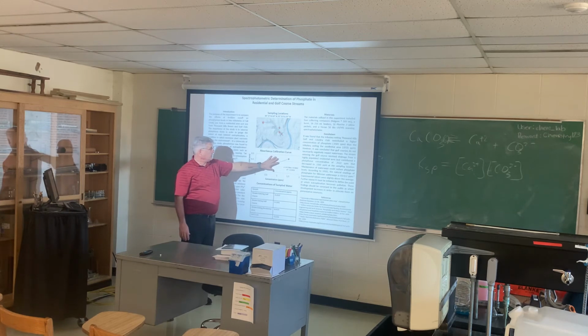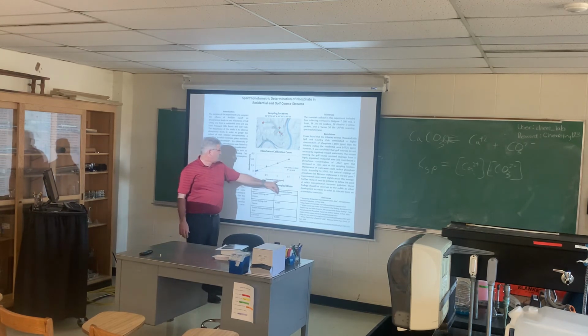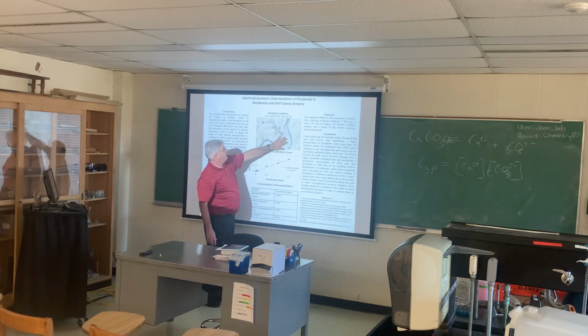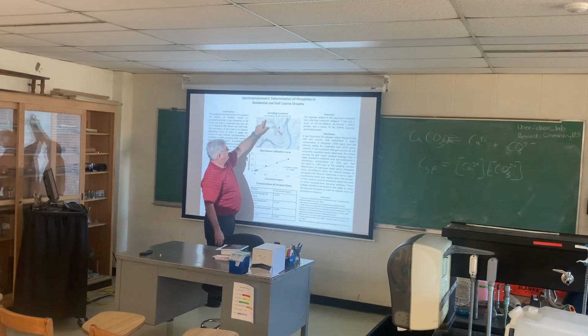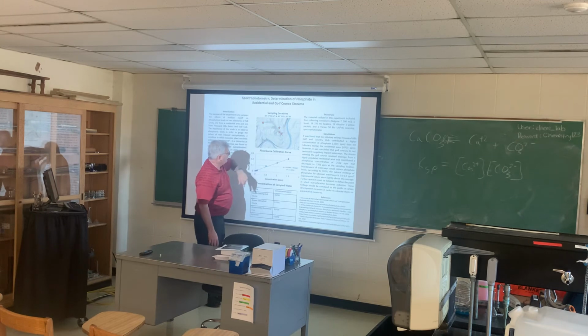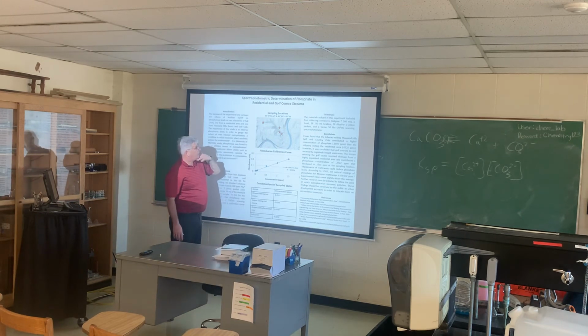This is a calibration curve, made from Beer's law. It's absorbance versus concentration. Now absorbance, this is an incorrect thing here. Absorbance has no units, so it's not in nanometers, just to let you know that. This is a picture showing the sampling locations, actually giving some coordinates related to those. And I think there should be coordinates for each location.